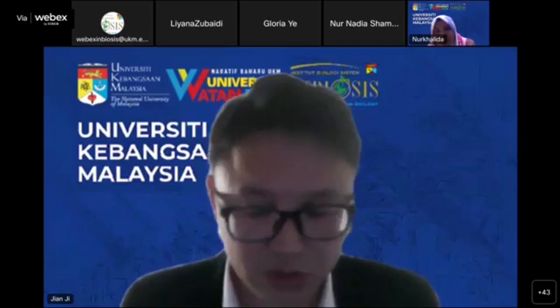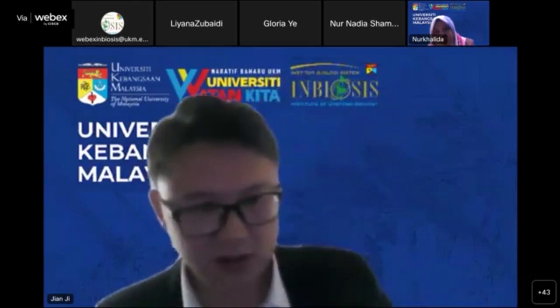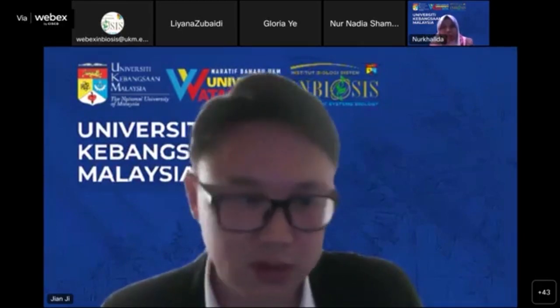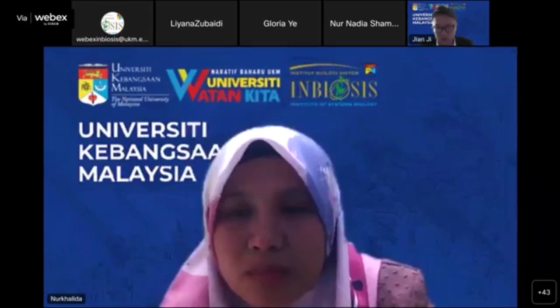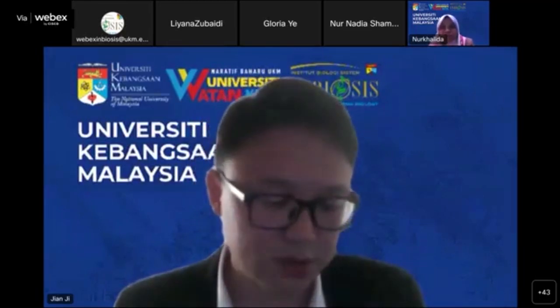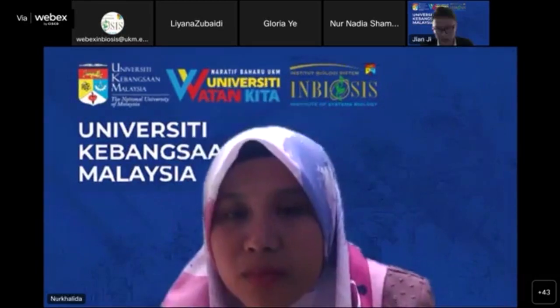Even if we use the same machine, the same solvent, the same parameters, even the same column, there is always some difference in retention time. Even in the same lab, it will change with time. So I think targeted is good, but we have to spend a lot of time to keep the machine in a very good condition, then it will work.